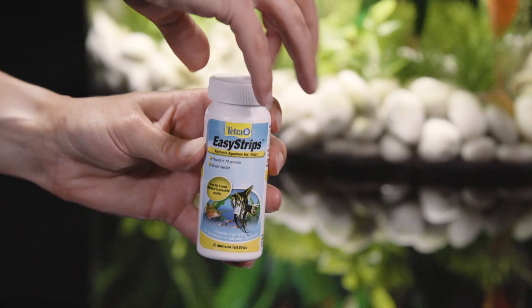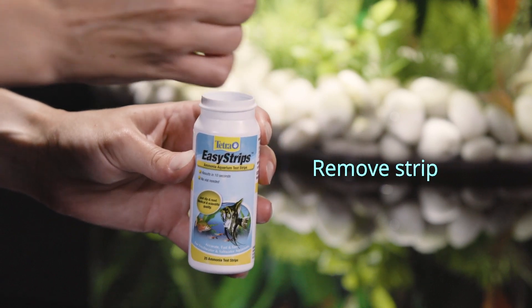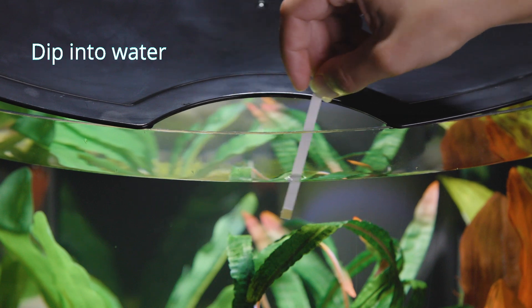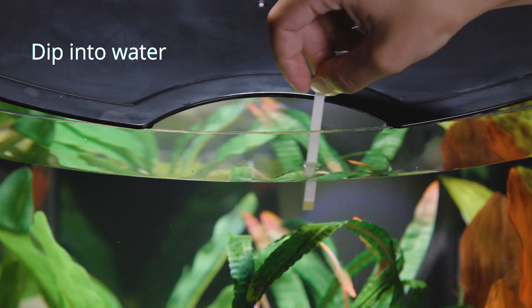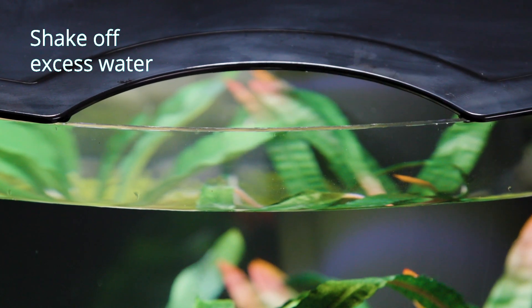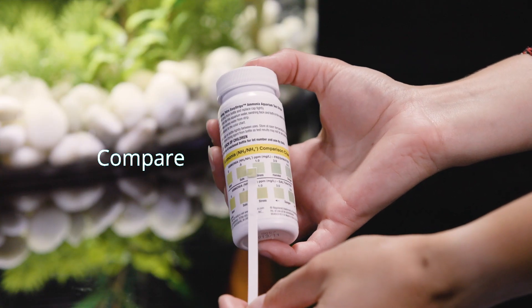Remove one test strip and hold at the end with no pad. Be sure to close the lid tightly after removing. Dip the strip into aquarium water for 10 seconds, swishing the strip back and forth, and remove. Shake any excess water from the strip, then immediately compare the strip to the color chart on the bottle.